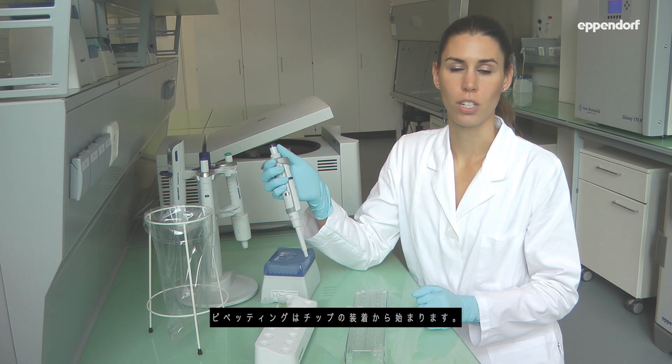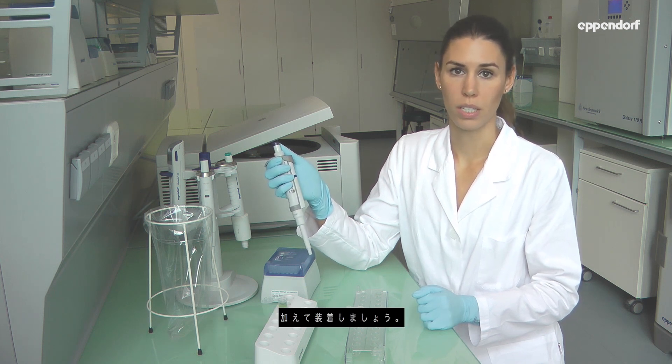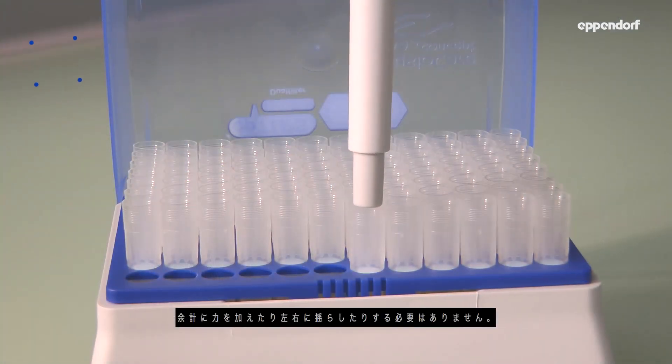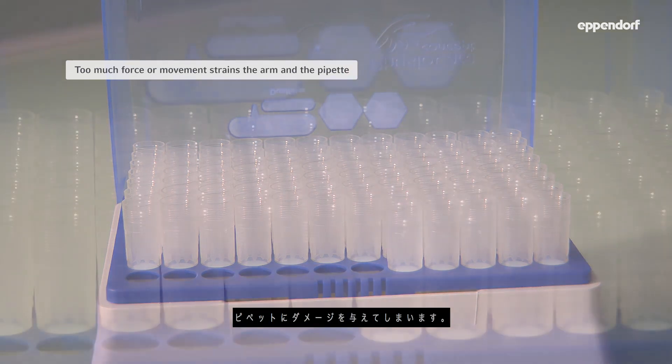Pipetting starts when you attach the tip. Apply light pressure to insert the pipette into the tip. There is no need for force or moving from side to side, as this would only strain your arm and damage the pipette.